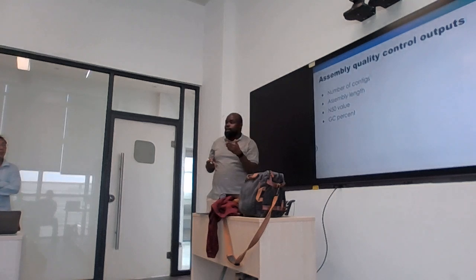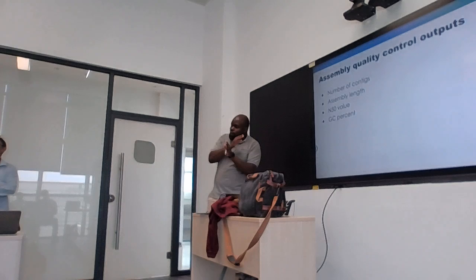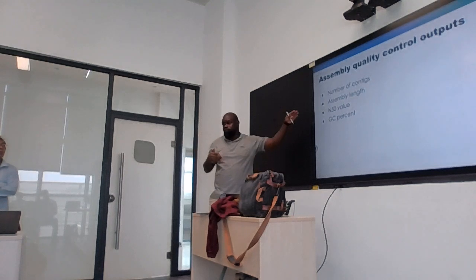But if you get that a large proportion are from another species, and especially if the proportion of your GC is very close, the question is, is it another species within the same genus, for example? Okay? So that is something you have to think about. Ideally, I should have talked about Kraken. So Kraken should also help you.